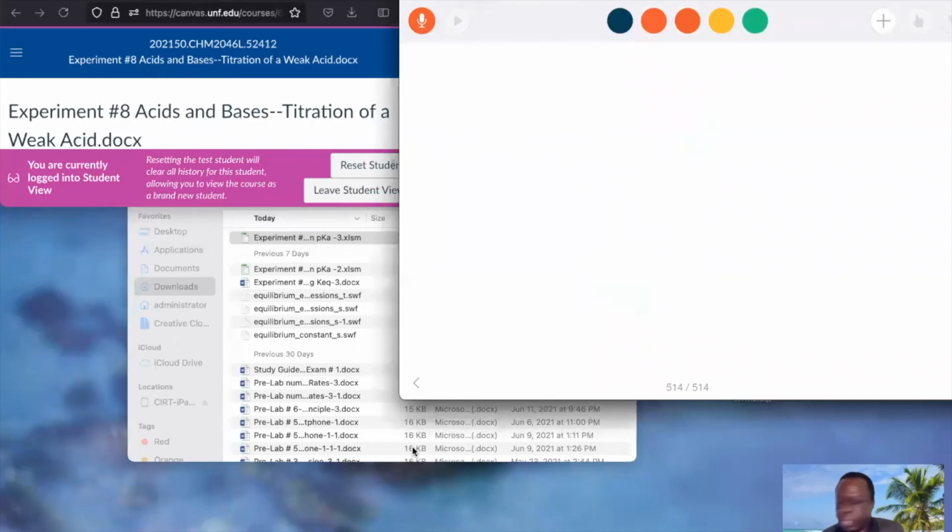What this means is, if 15 is right here, we will add 0.1 around 14 right here, and these will be 16, and then 30 going to 31, and coming down here 29.